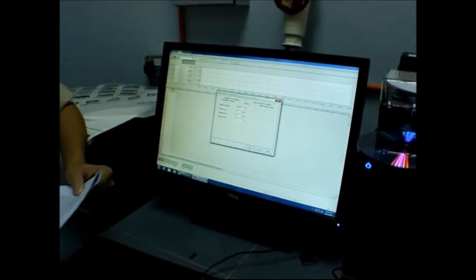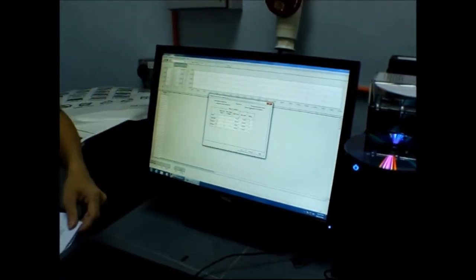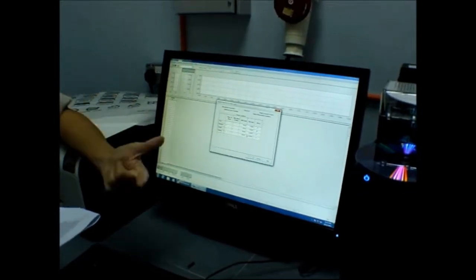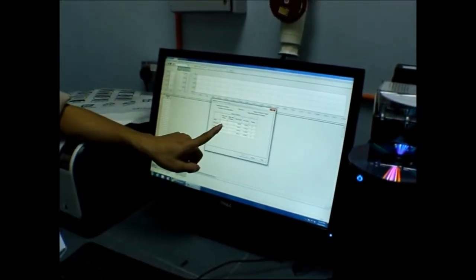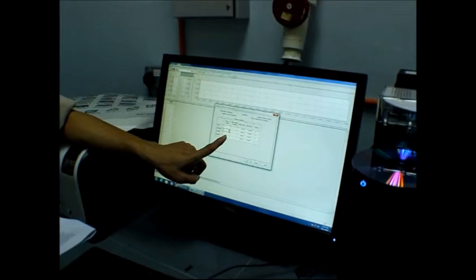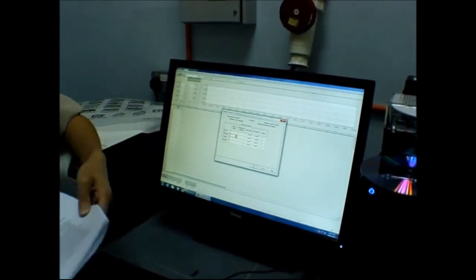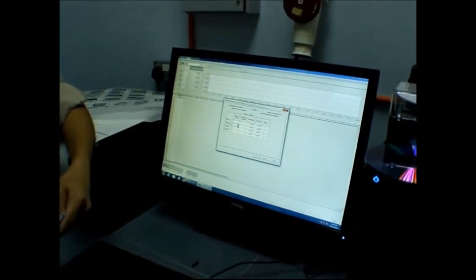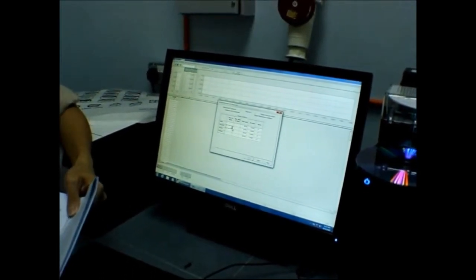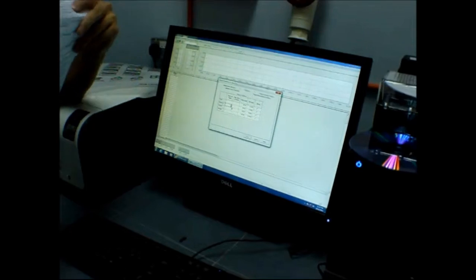Okay, finish. Then you go to repeat measurement condition. You need to set your setting. What is your RSD limit? How many replicates do you need to run? One is not enough. Three, at least 3, of the same sample. Then take the average among them. If one of them is out, then maybe you need to add one more.